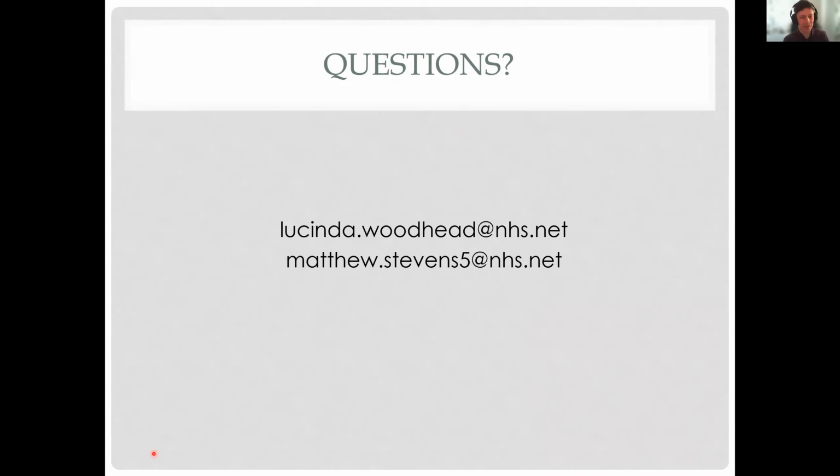It's hard to say without being able to see the plots, but there were slight differences throughout, and it's mainly due to the scaling that we've used. But that's all adjustable on both the XF and the Canto, so you can adjust that as you would. And from the use I've had with the XF, it's very easy to do that, even with me being used to using the BD analyzers as well. Yeah, so all adjustable. Cool.